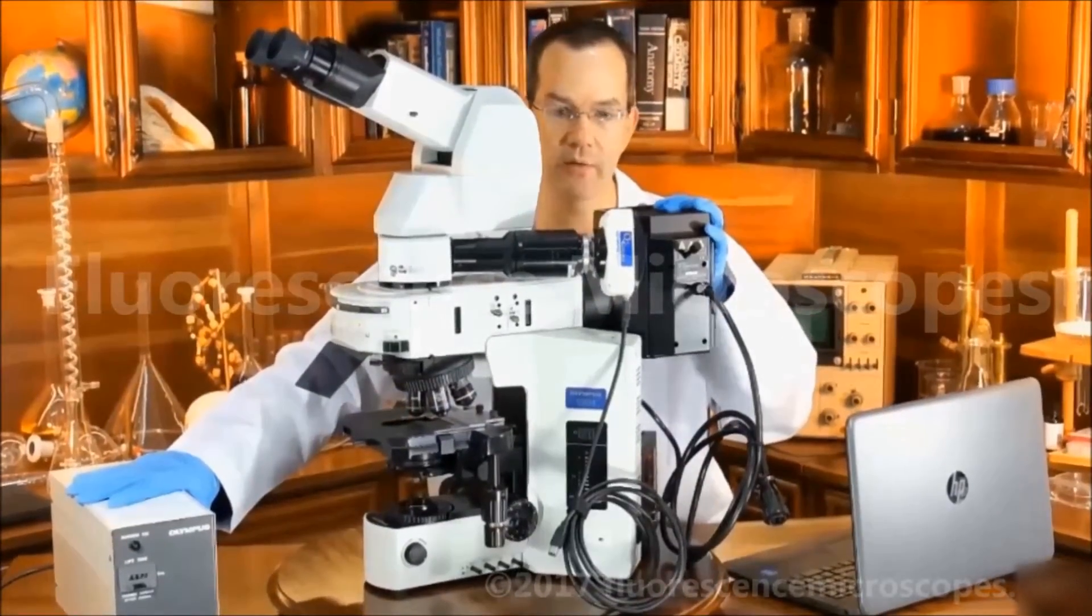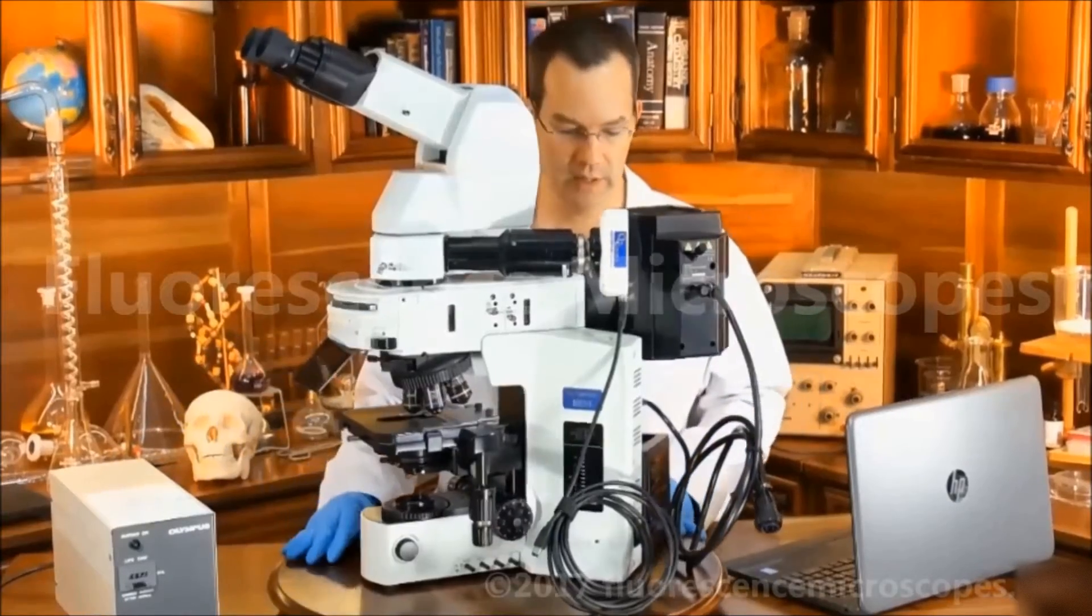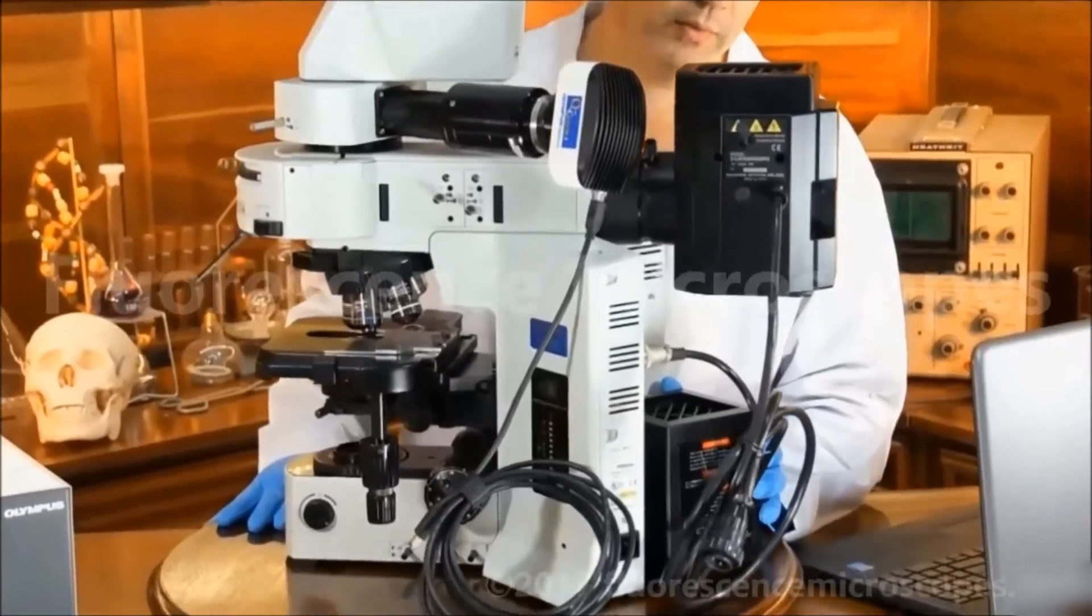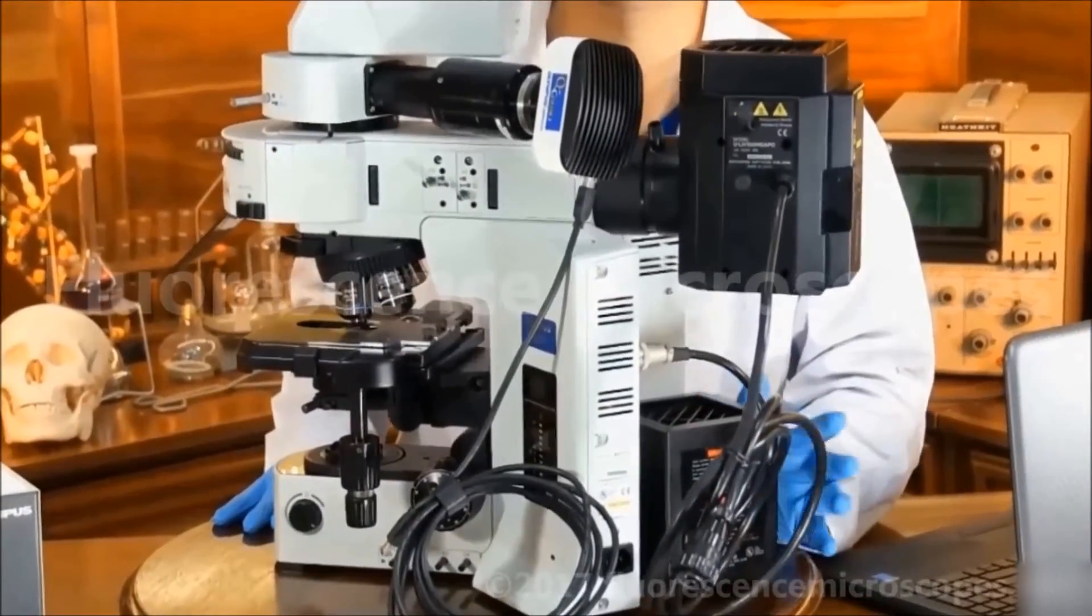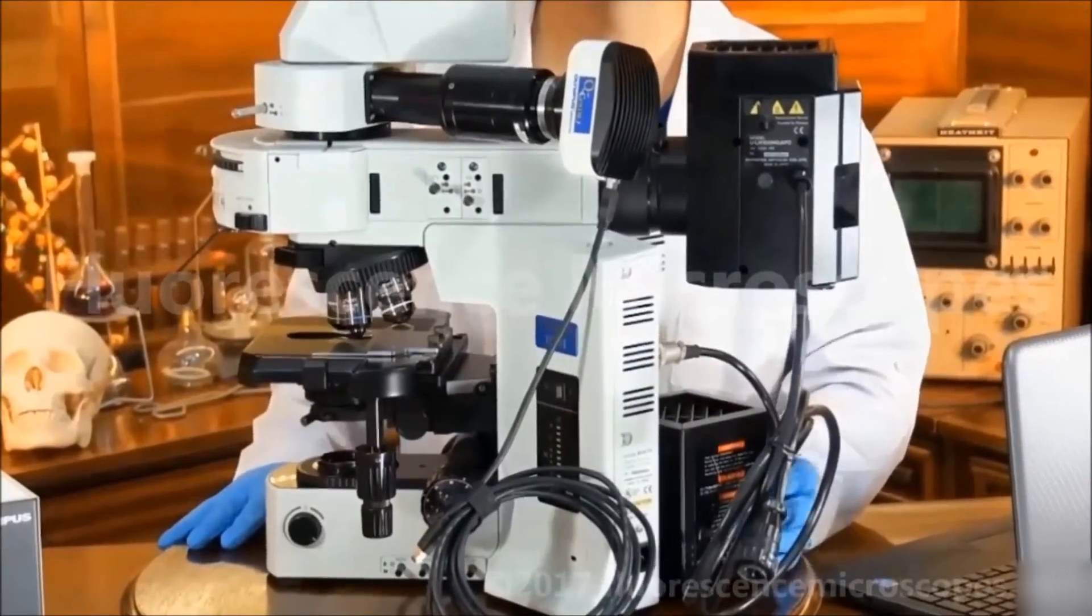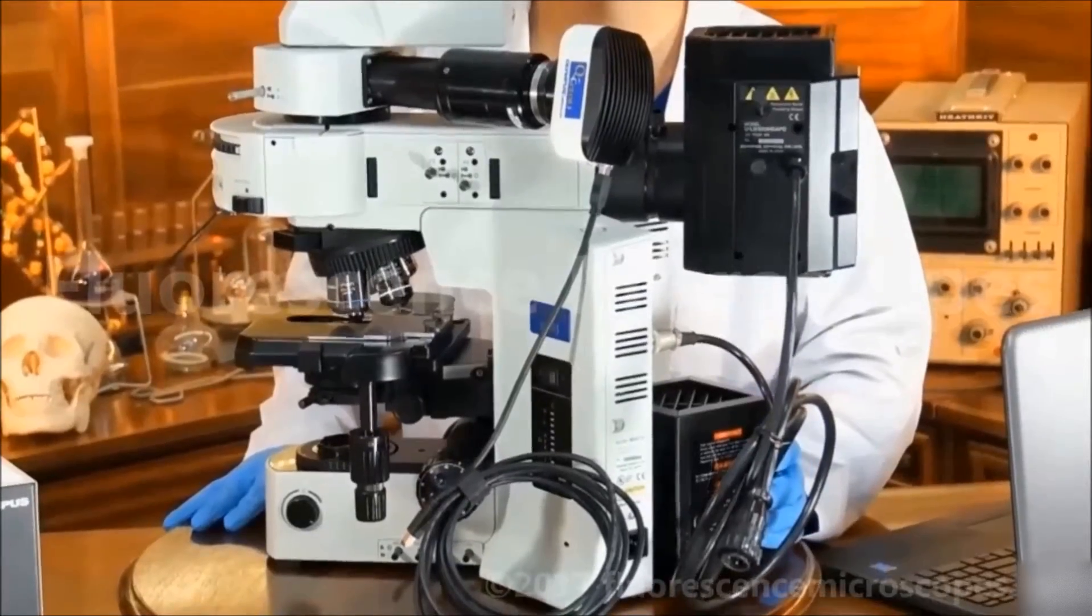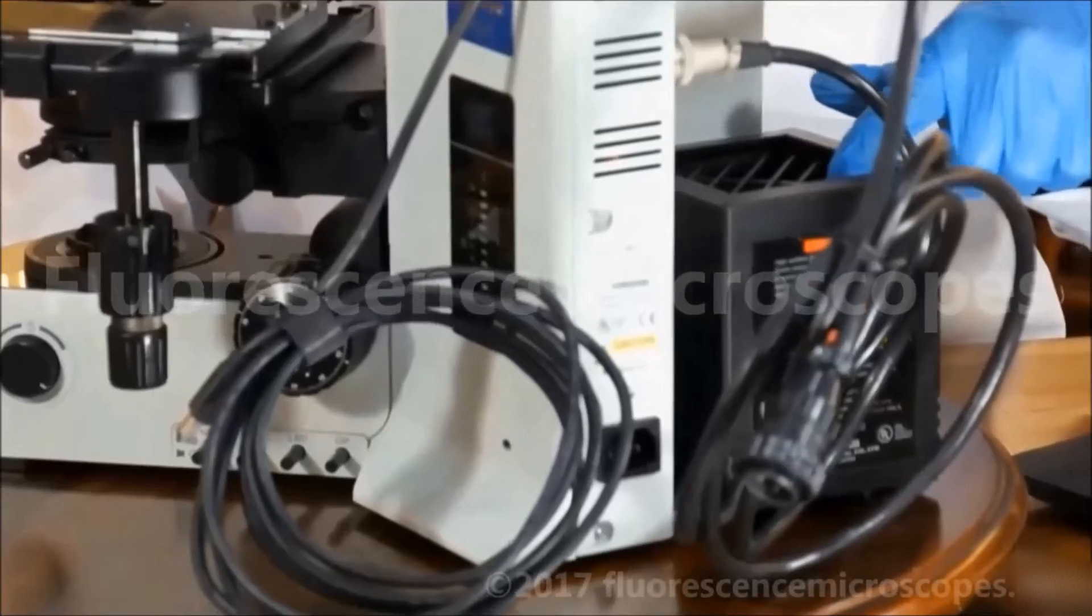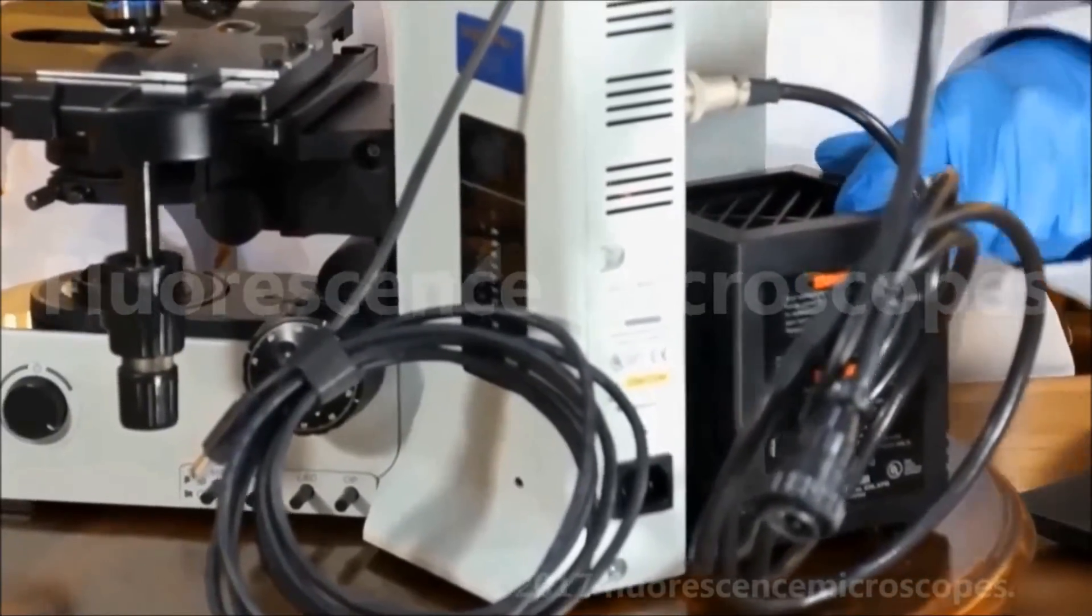This is the lamp housing. We've also got a 100 watt halogen transmitted light. We've also configured it with a 100 watt halogen transmitted light system. There's a halogen bulb, 100 watt, 12 volt inside this lamp housing.